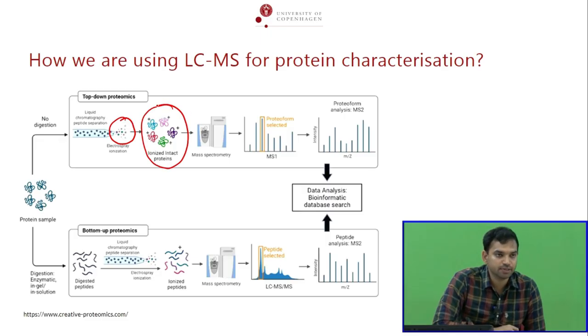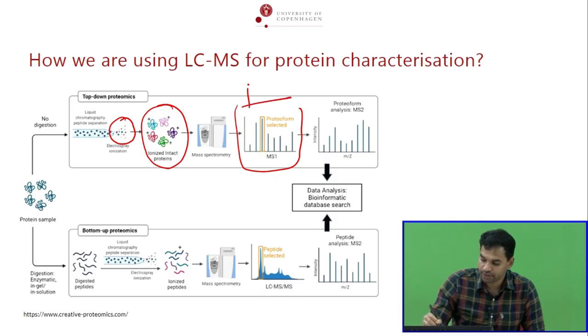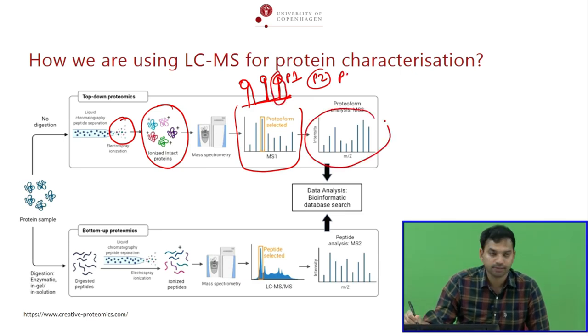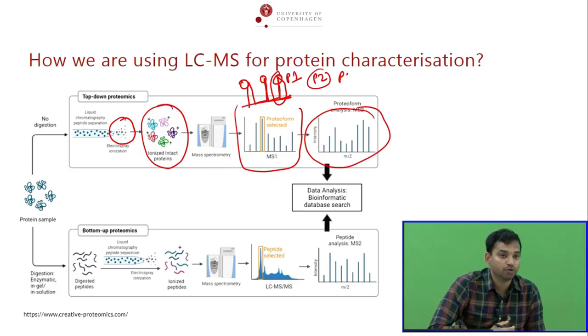You can see different ions, and they are separated in the mass spectrometer, and you get an individual chromatogram like this. Each peak in the chromatogram may be associated with a different type of protein, protein 1, protein 2, and protein 3, right? And under each peak, you have a mass spectrum. That will help us to identify unknown proteins, because the mass of a protein is very unique, right?